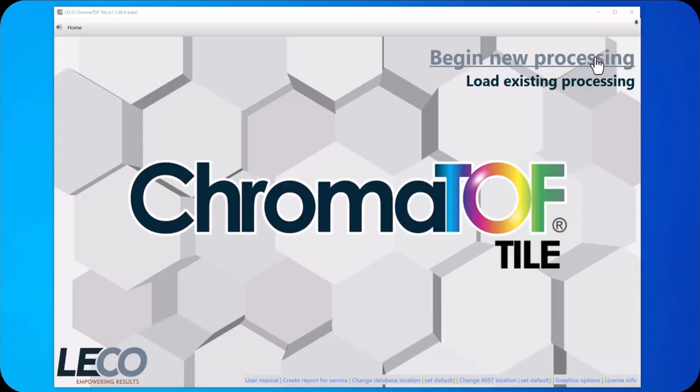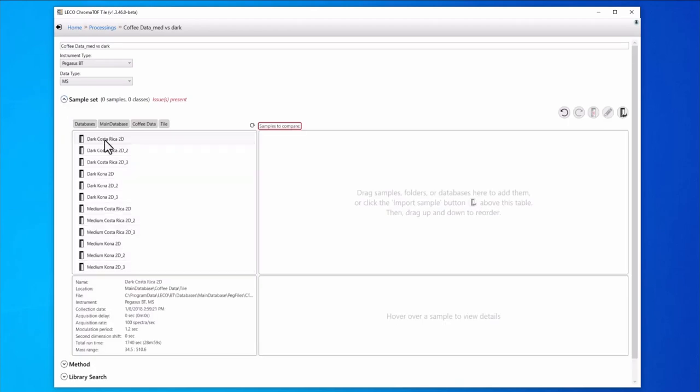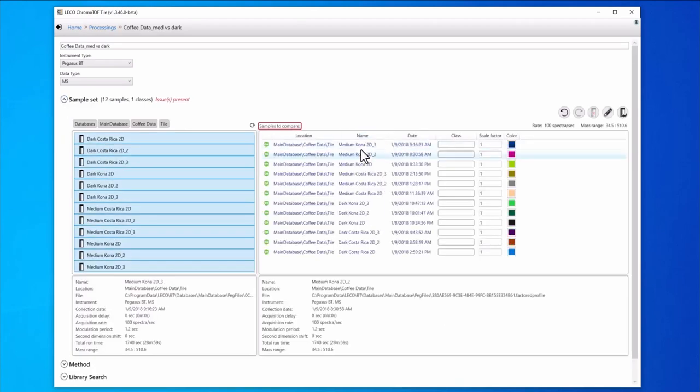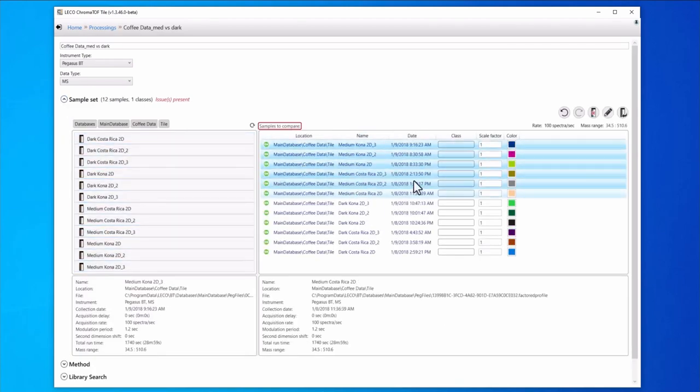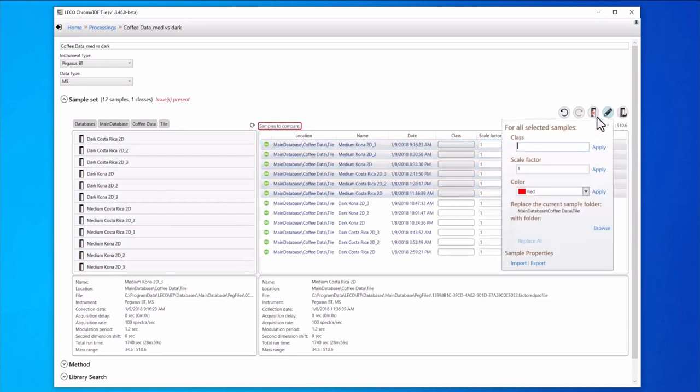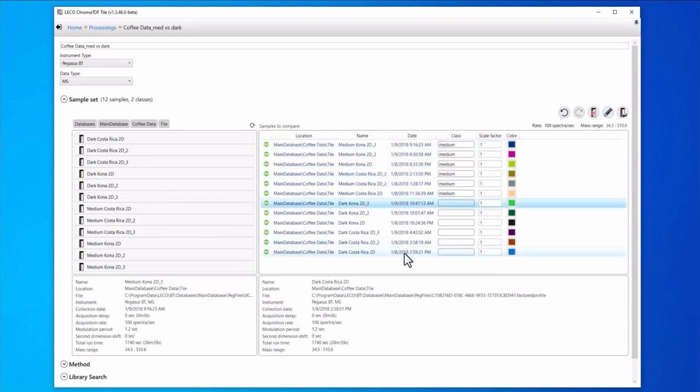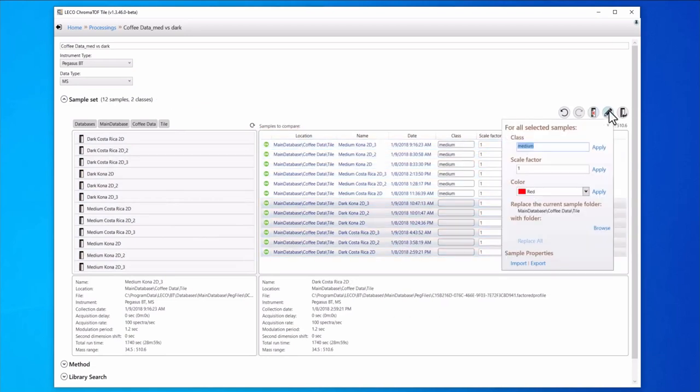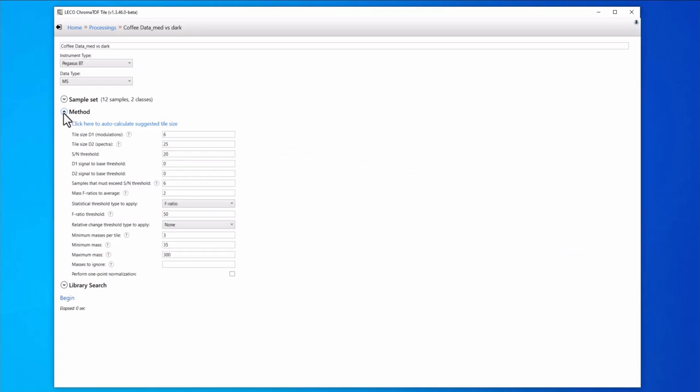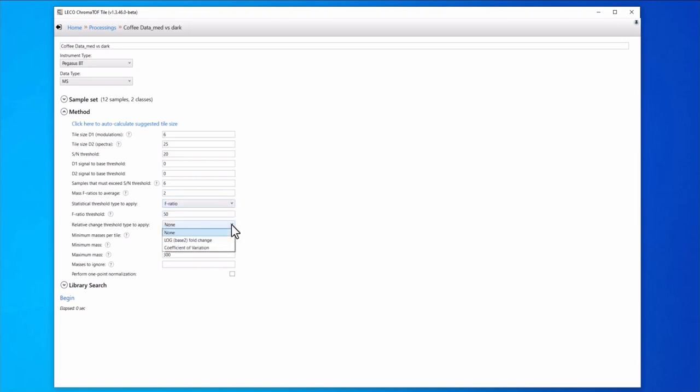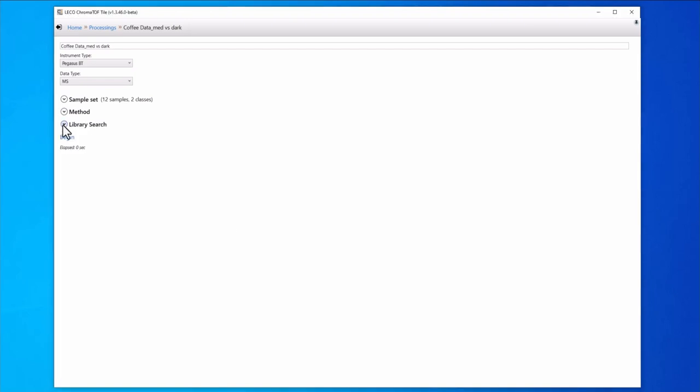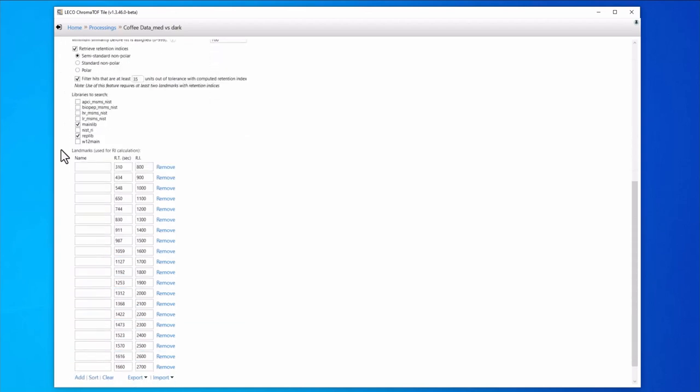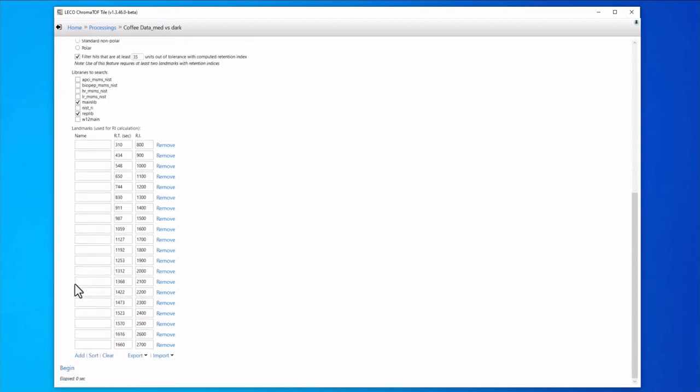We set up a data processing method in ChromaTOF Tile. We select the samples that we want to compare from our ChromaTOF database. Then we group the samples into their classes. Here we have our medium and dark roast samples. The data processing parameters are used to set the tile size and various other thresholds. Different comparison options can be selected which gives flexibility for different experimental designs and analysis objectives. Library search parameters and retention index landmarks can also be entered before clicking begin to start the data processing.